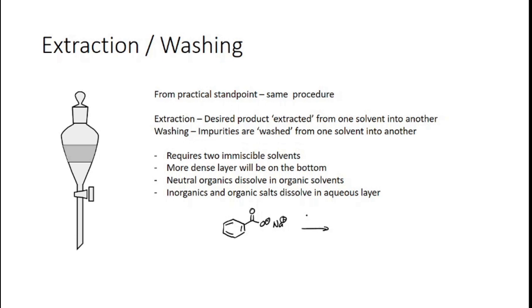As you will recall from that, you added some hydrochloric acid. When you acidified it, you converted it from the sodium carboxylate salt into the carboxylic acid. And so now it is not an ion, it is a neutral compound, neutral with respect to ionization. And so it is organic, it is no longer water soluble, but in this case we did not extract it, it simply precipitated out of solution.